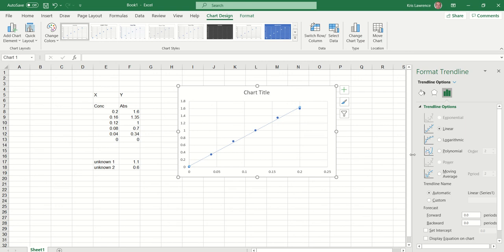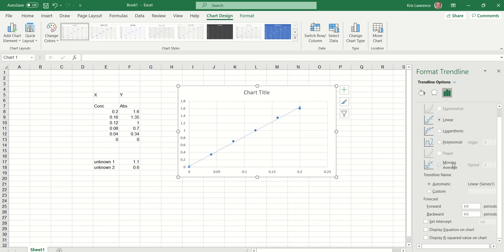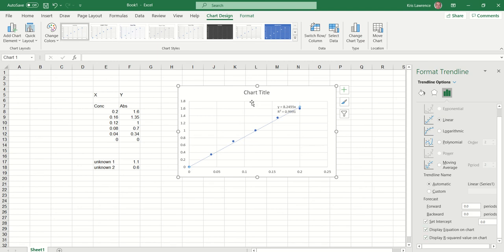Now for the line of best fit, there are a couple of things we want to set. On the right-hand side here are the options for formatting the trend line. What we want to do is set the intercept to zero — we know our blank had zero concentration, so we want to force the line through the origin. You can also tick the other boxes to display the equation and your R-squared value.